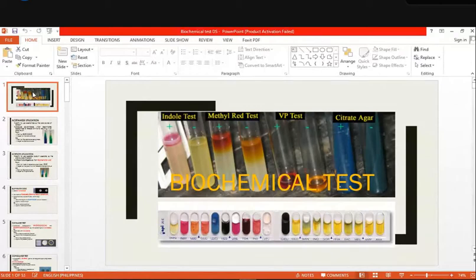Yung mga biochemical test natin so that we have the single substrate utilization, pwedeng depende sa enzyme present. So we call that the enzyme test. We have the tolerance test. If you remember, this sa ating bacterial growth and cultivation. When we say tolerance is the ability of the different microorganisms to be able to grow in extreme environments. So, to-tolerate nila whatever environment they are in.